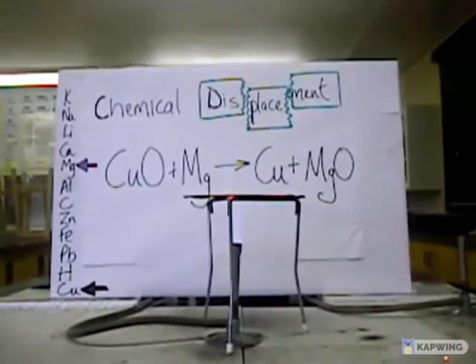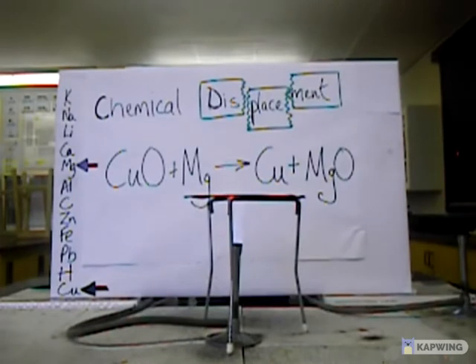There you see lots of smoke created in a highly exothermic reaction. The displacement of copper from copper oxide by the more reactive metal, magnesium.